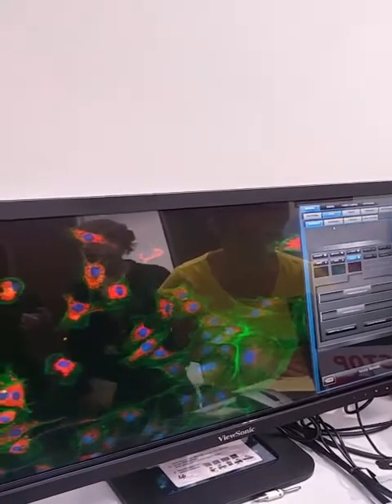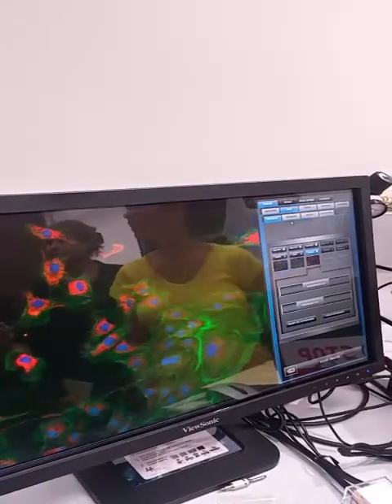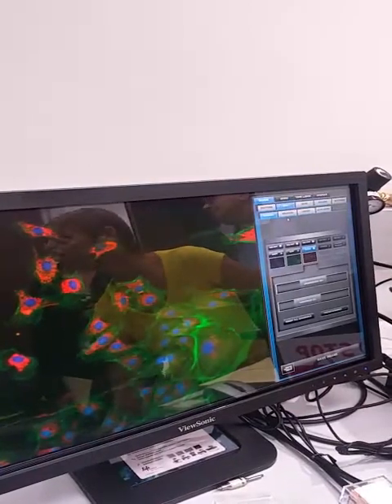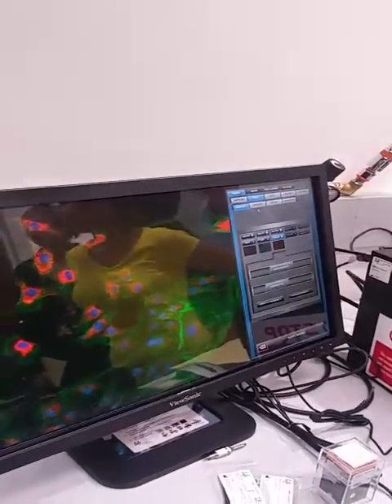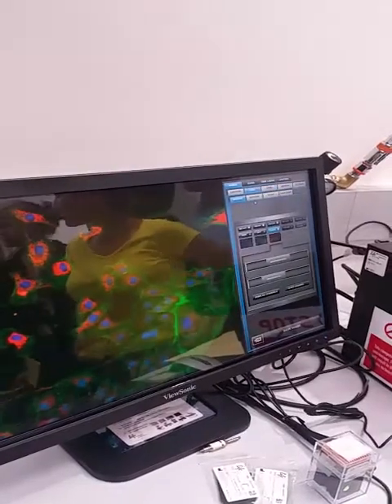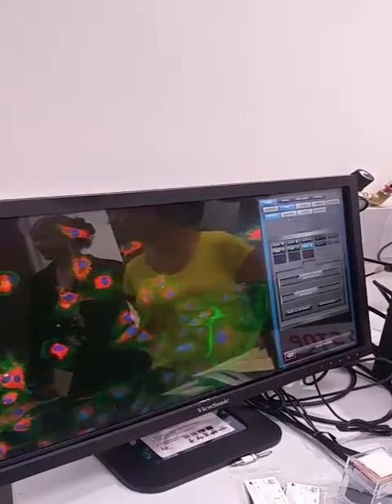Can you change the size of the scale bar? It's specialized for each objective, so it changes with the same objective. So it's like 20 microns on one objective and it just scales up from there.